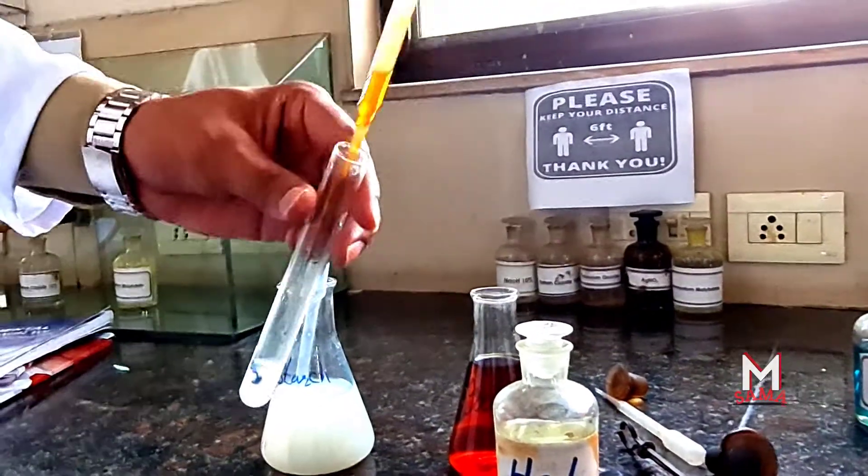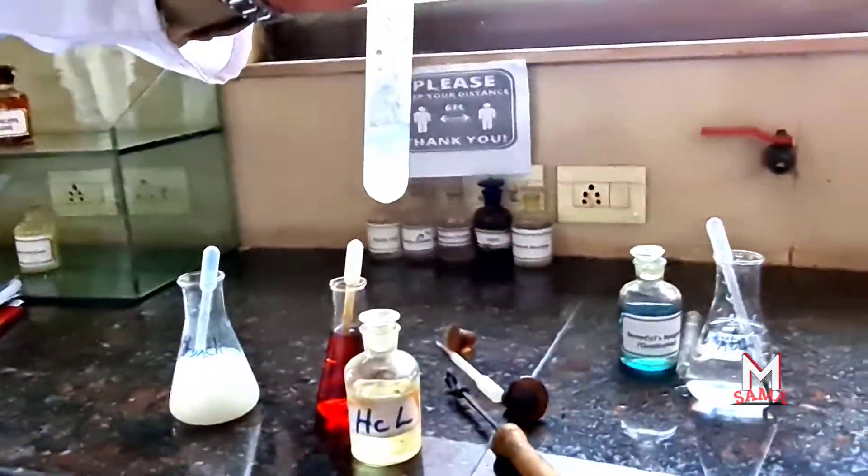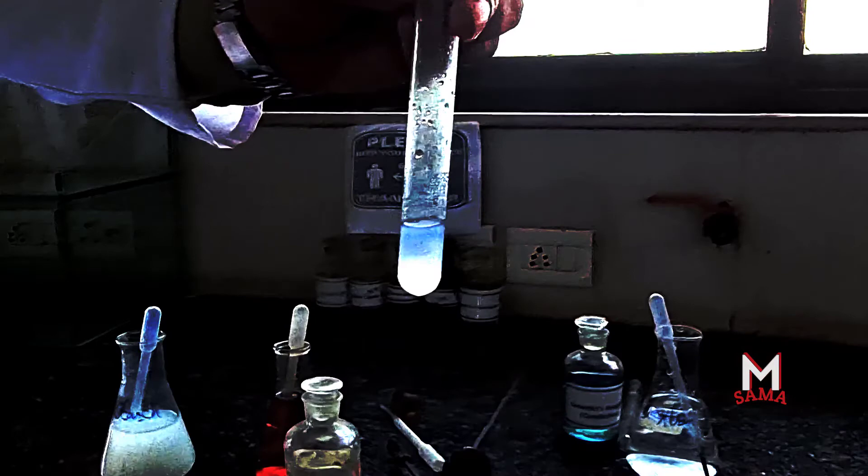Let's see what will be the result. The blue color indicates the presence of starch in the solution, while the color will be reddish brown in case of glycogen and reddish purple in case of dextrin.